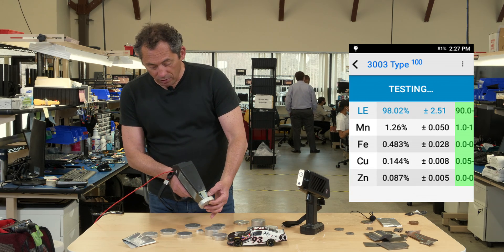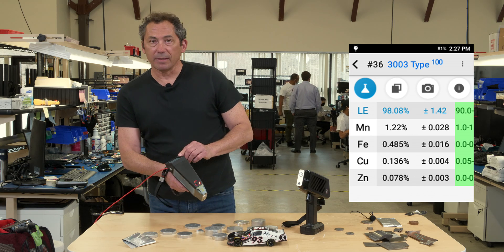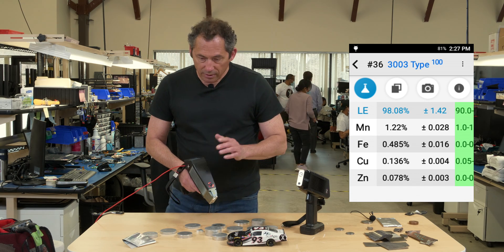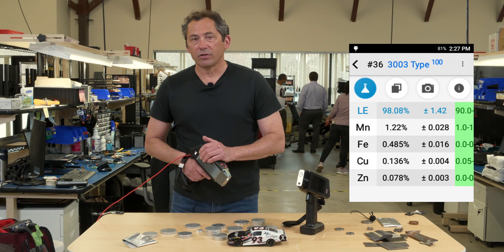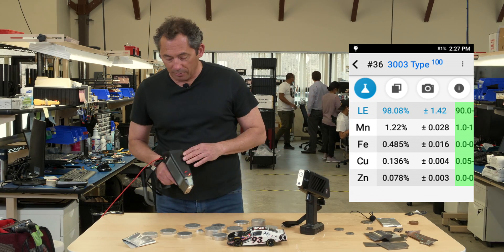Here's a 3003 — it sees the high manganese, up around 1%. In the simple way to do it, the gun is trained to say: if I see about 1% manganese, it's most likely a 3003.